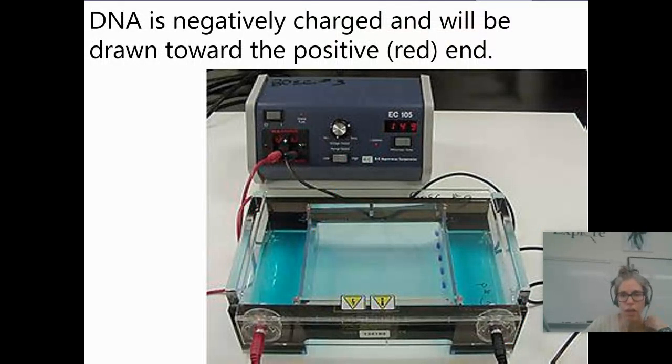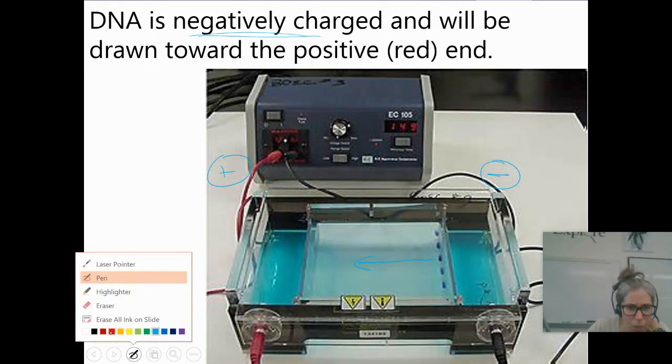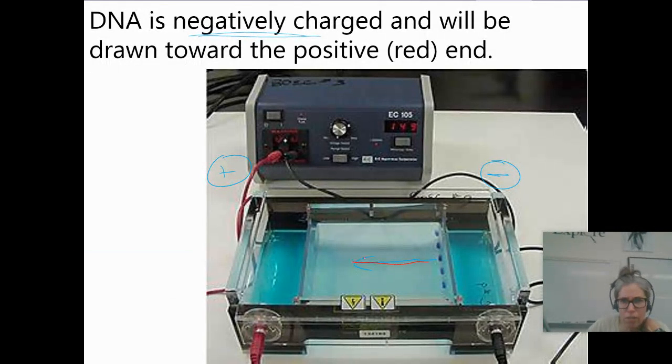Okay, so then your DNA is negatively charged. And so what you do is you put the negative electrodes here, the black ones are negative and the red ones are positive, and you line it up like this because if DNA is negative, it's going to be pulled toward the positive electrodes. And so this thing is a power source, and here's the gel.